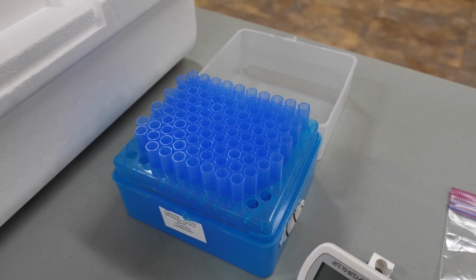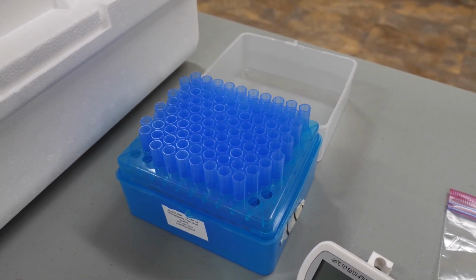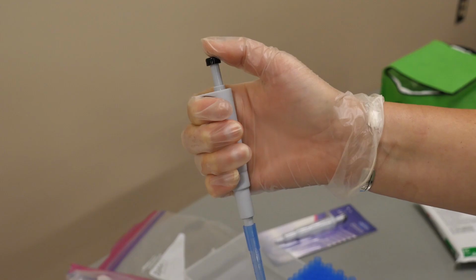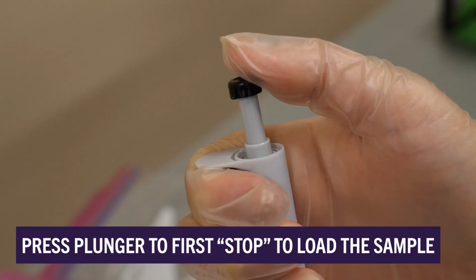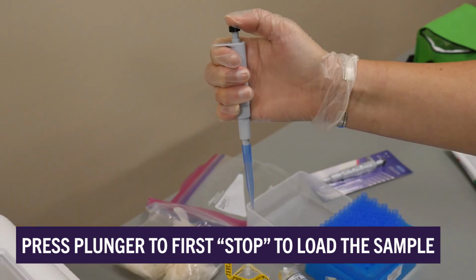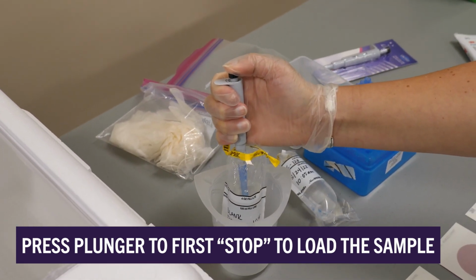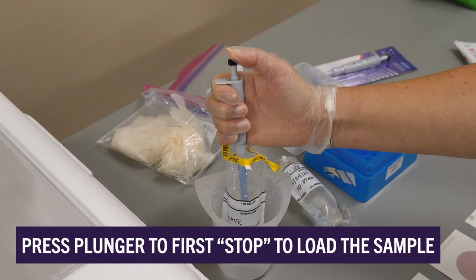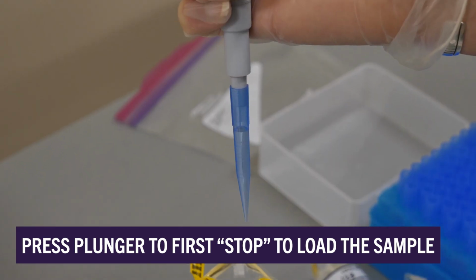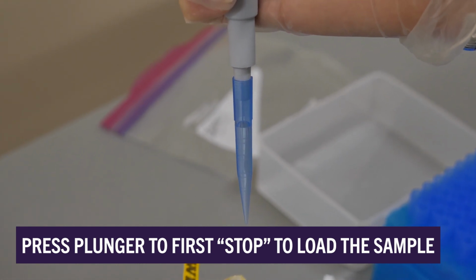You'll need to use a separate sterile tip for each Whirlpack bag. So in other words, use 1 tip for the blank and use a second tip for the 3 stream sample plates. To load the pipette, press the plunger down to the first stop or point where you feel resistance. While holding the plunger at that point, place the tip in the water, then slowly release the plunger. This will load an exact amount of water into the sterile tip. One of the most common mistakes is loading too much water into the tip by ignoring the first stop.